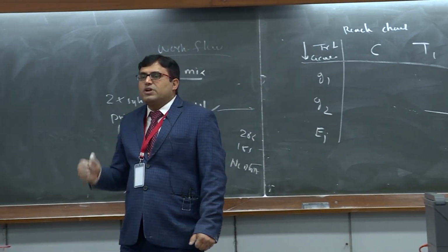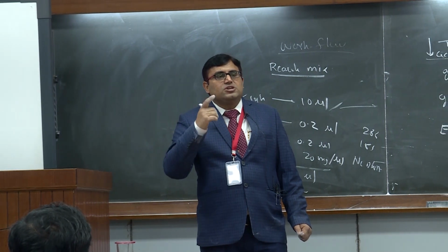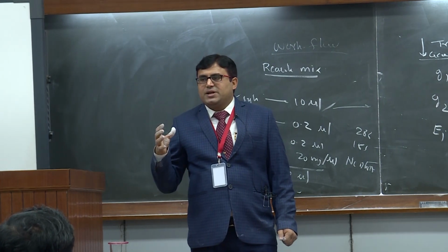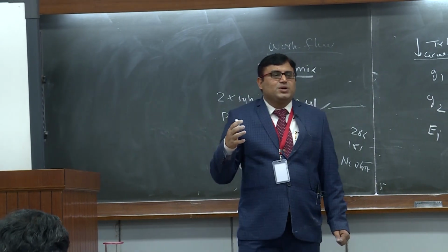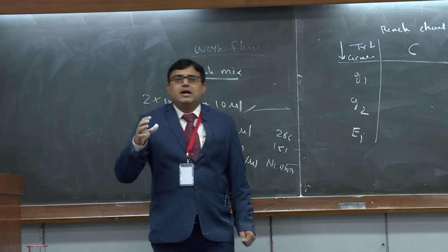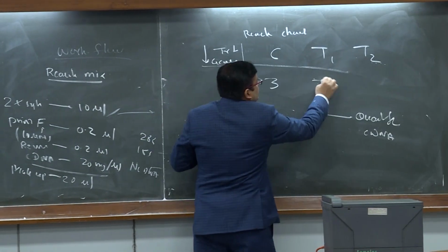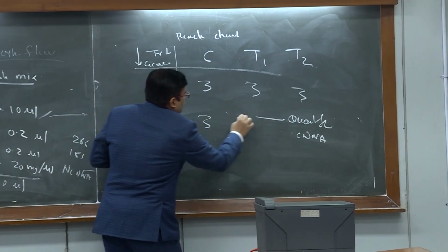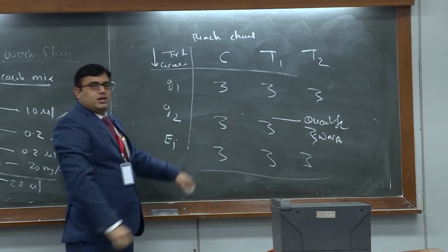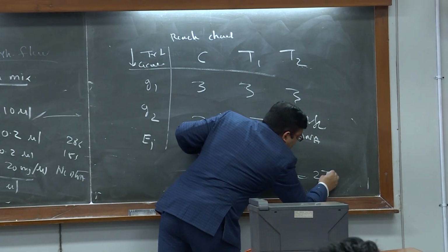Now in case of real-time PCR, the thumb rule is you have to keep the reaction in 3 biological replicates minimum. There should be 3 biological replicates, and if your lab is rich, you can take 3 technical replicates also. But at least a minimum of 3 biological replicates is recommended. So 3 means I can write here 3 like this, and then you total it. It means it is 27.